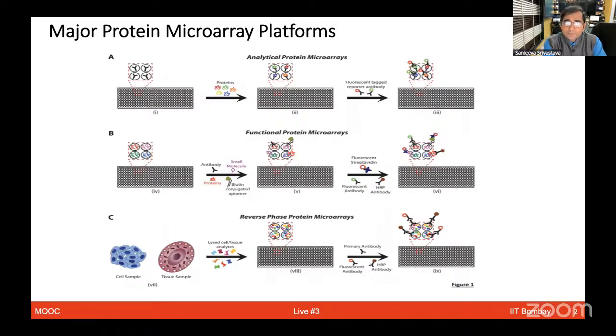It's very difficult. And therefore, different types of platforms have emerged, which aim to investigate proteins in different forms. For instance, if you're very lucky and you're looking at the yeast proteome, you have purified 5,500 or so proteins. If you're looking at a bacterial proteome, maybe you have purified all 1,000 proteins of that bacteria.